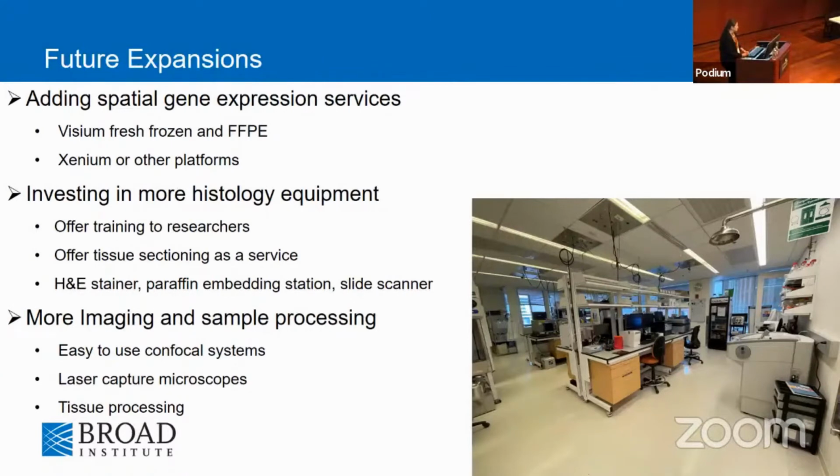And then tissue processing equipment. So things like the singulator from S2, that's becoming a real pain point for us at Broad. It's like, how do you process hundreds of tissues, thousands of tissues for these really big projects? So we've tried hacking some existing equipment like the Covaris DNA shears. It hasn't worked too well, so we're looking at other equipment that's out there on the market.